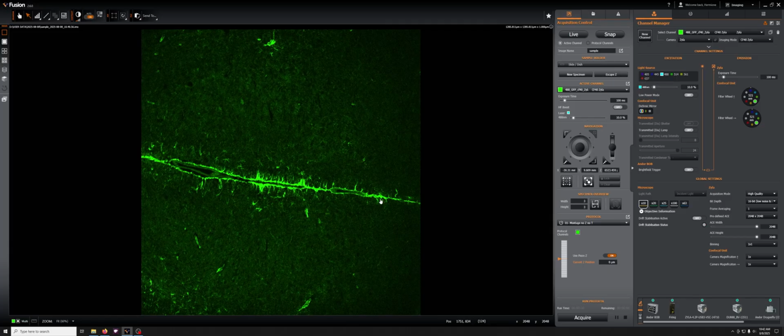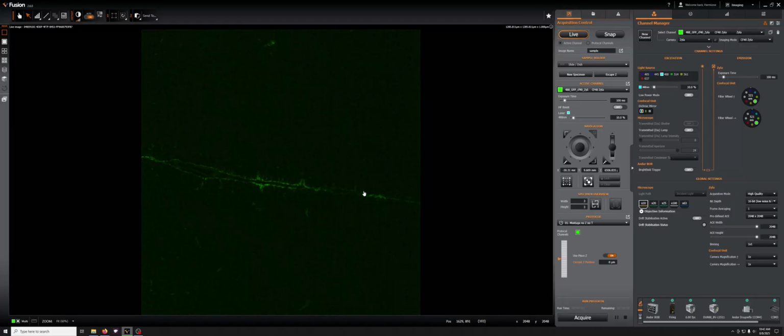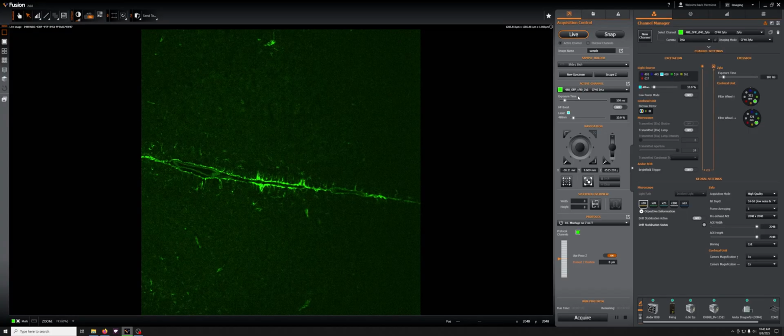So this is different than what happens when you try to do something similar from a microscope, where it doesn't go back to where you were. It goes back to what you had marked as your 0. So that's a slightly different behavior, but I think it's useful in the sense that wherever you are, let's say you were here, if you escape, you'll come back here. If you were at a slightly different focal plane, such as this one, and I escape and I come back, it'll go back to that last place where I was. Not anywhere that I marked as special, just the last place where I was.